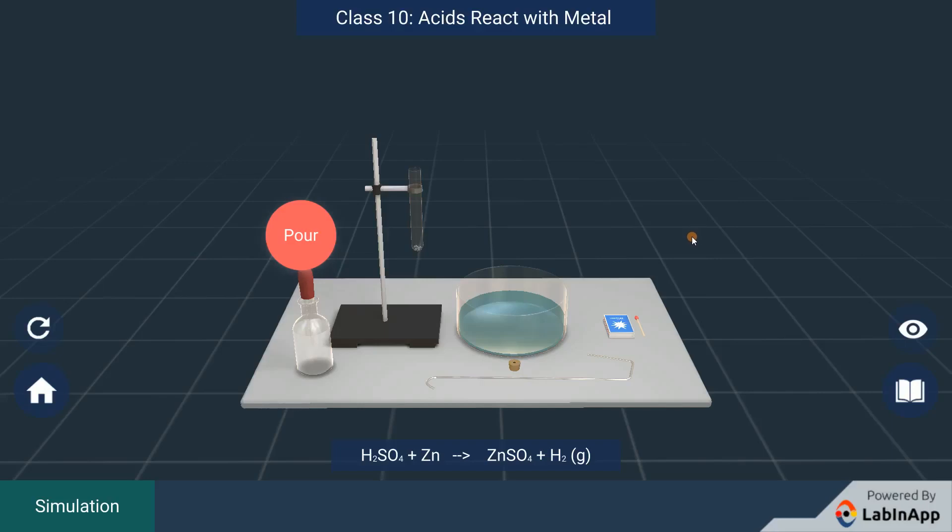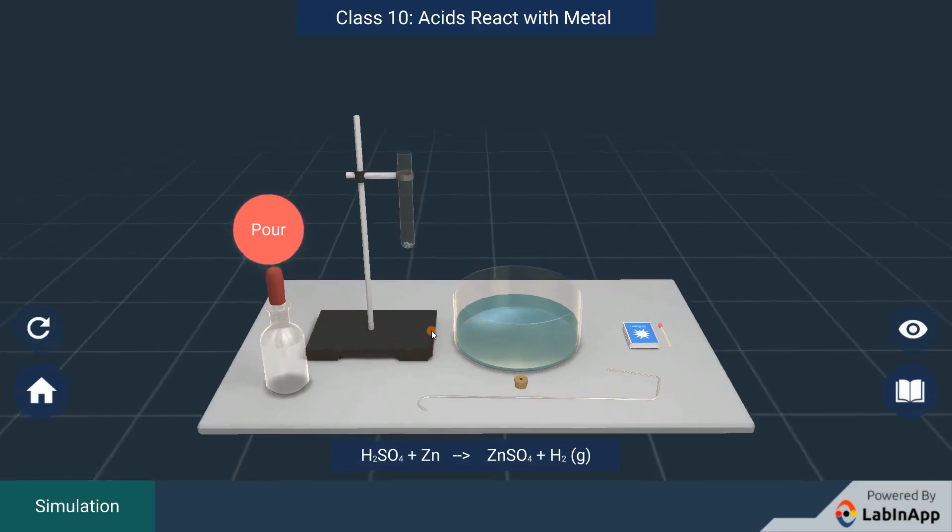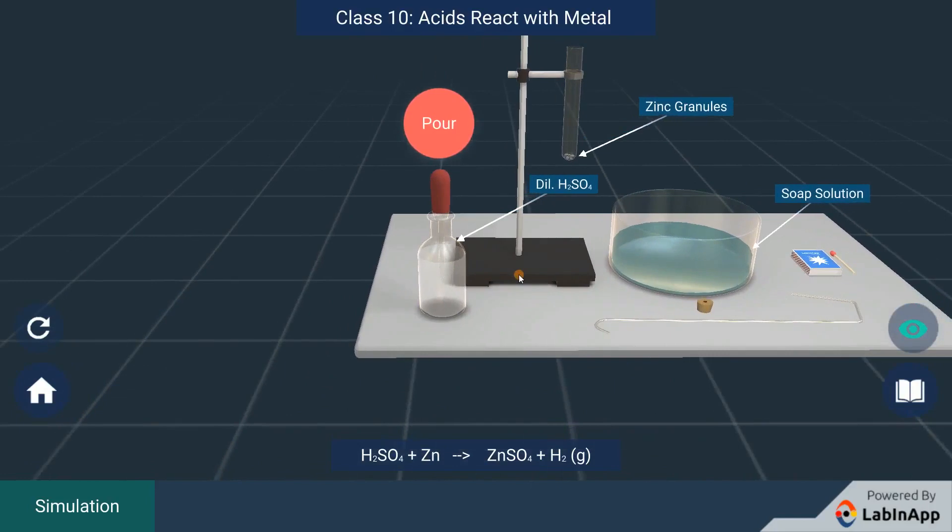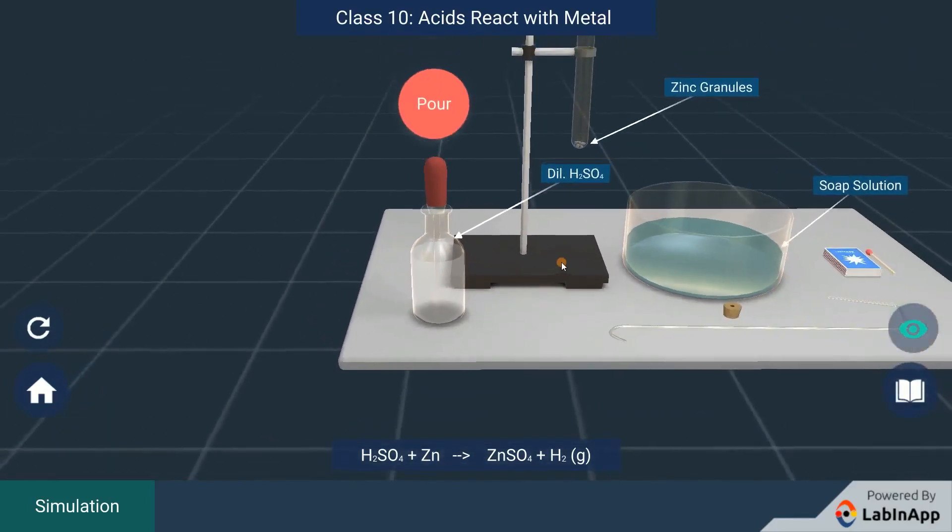Acids react with metal. What will happen when acids react with metals? Let's see this through an activity. We have taken dilute sulfuric acid, zinc granules, and soap solution.